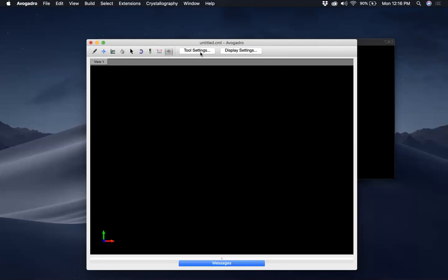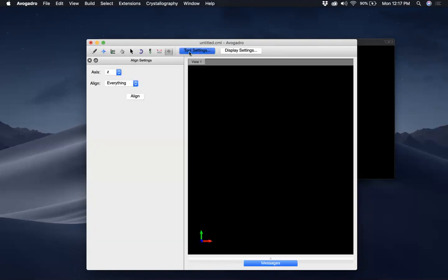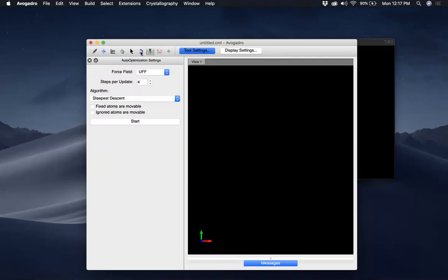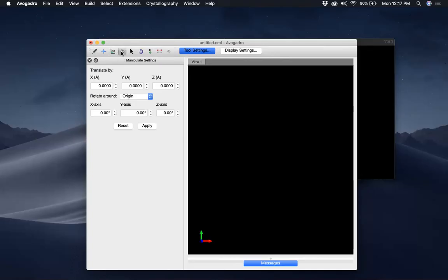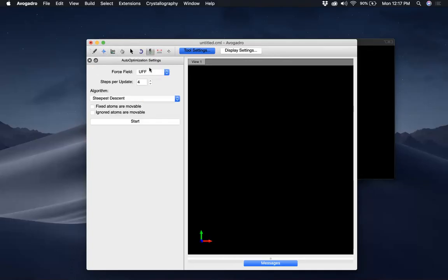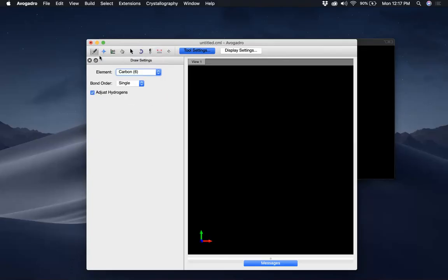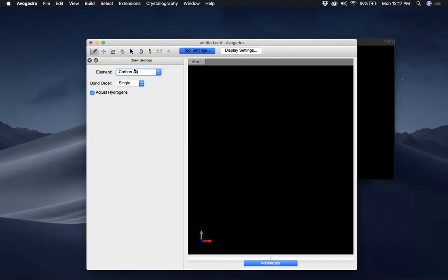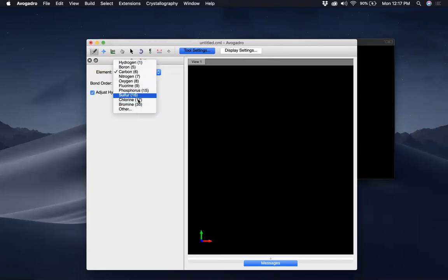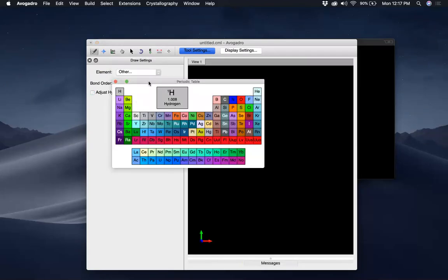For each tool you have different settings. For the Auto Optimization Tool you have options to pick a force field and so on. For the Draw Tool where you create atoms, it gives you different options. You can see some of the atoms listed, and if you click 'Other' you see the entire periodic table.